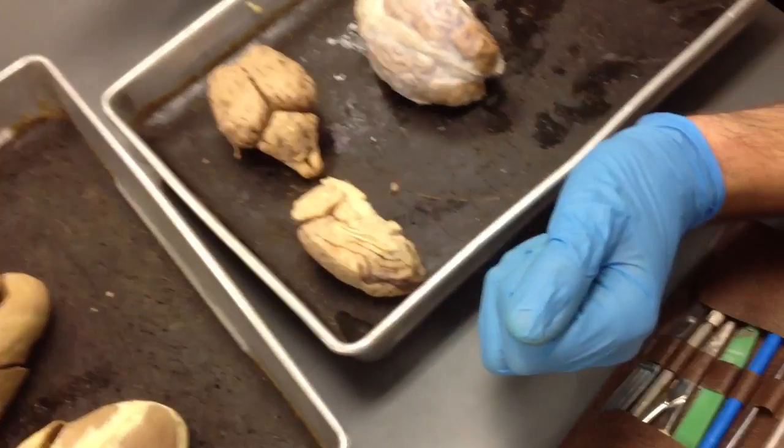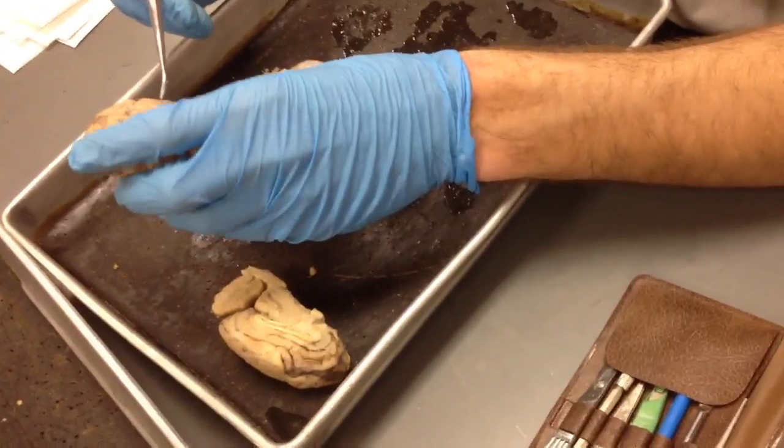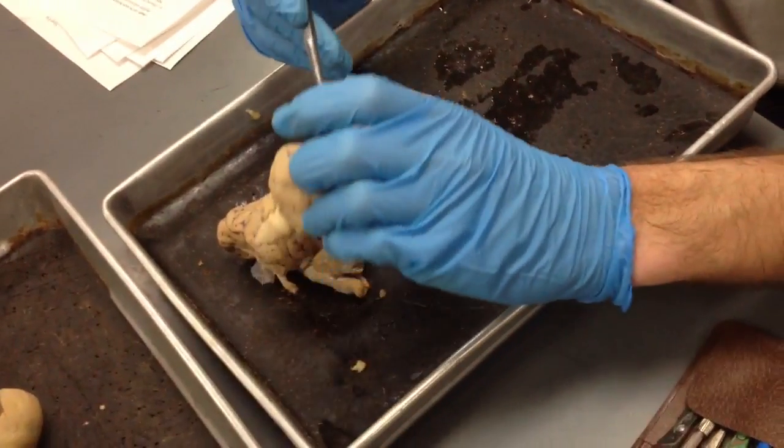The gyrus and the sulcus. Okay, so the gyrus are all these raised areas, where the sulcus are the depressions.